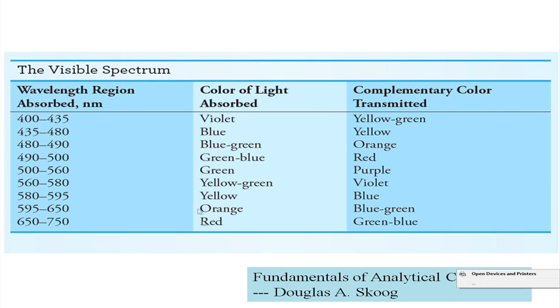So, the complementary colors you can write very quickly, and the ranges are also not very large. Some of the ranges are big enough, but some of them, you see, this is 35 nanometer broad, this is also 45 nanometer. So, this is 30 to 50 nanometer of broadness, only the red range is quite a broad range, which is only 100 nanometer.